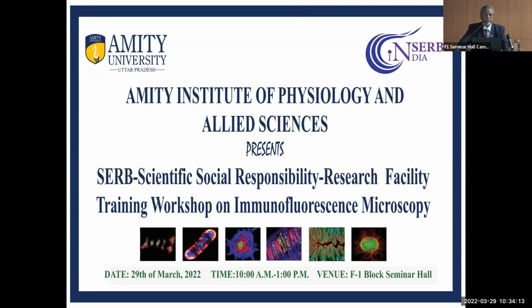This can be done with any type of material on slides, and also histological slides, which can be stained to locate where an antibody is labeled. Live cells you can also do under confocal conditions. There are several details, but I won't go into all of them. These are very basic things and one should know them. It is a very basic and standard technique.